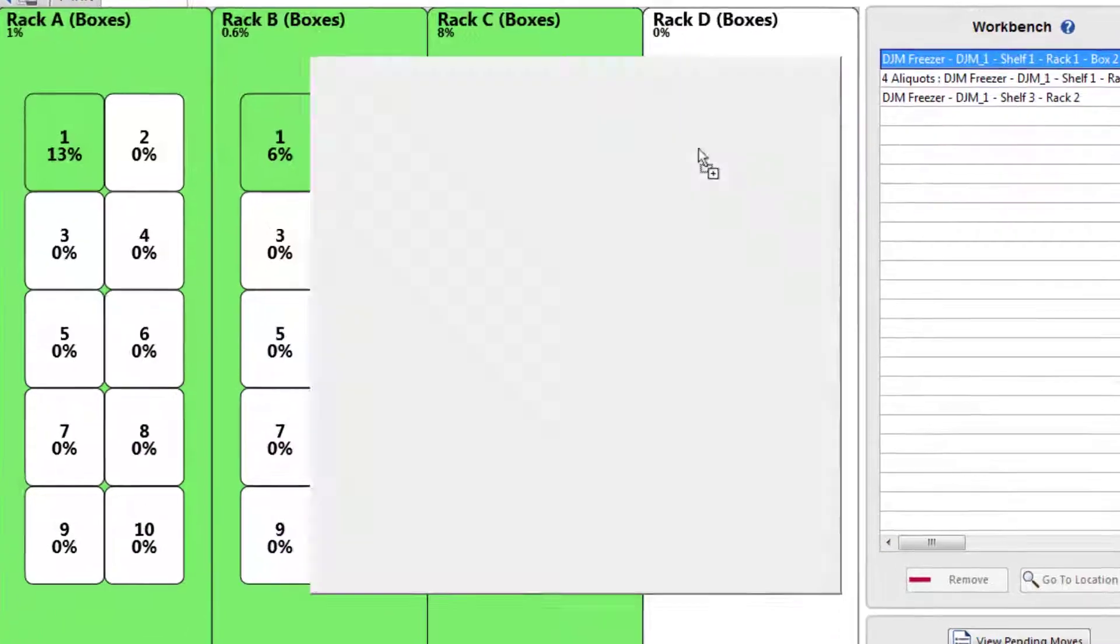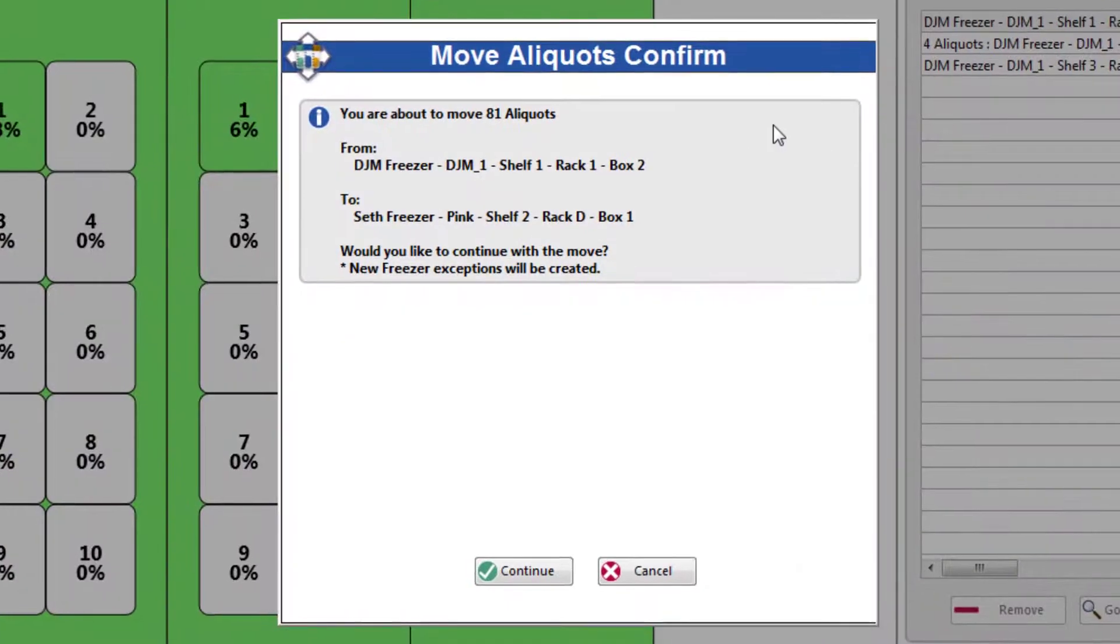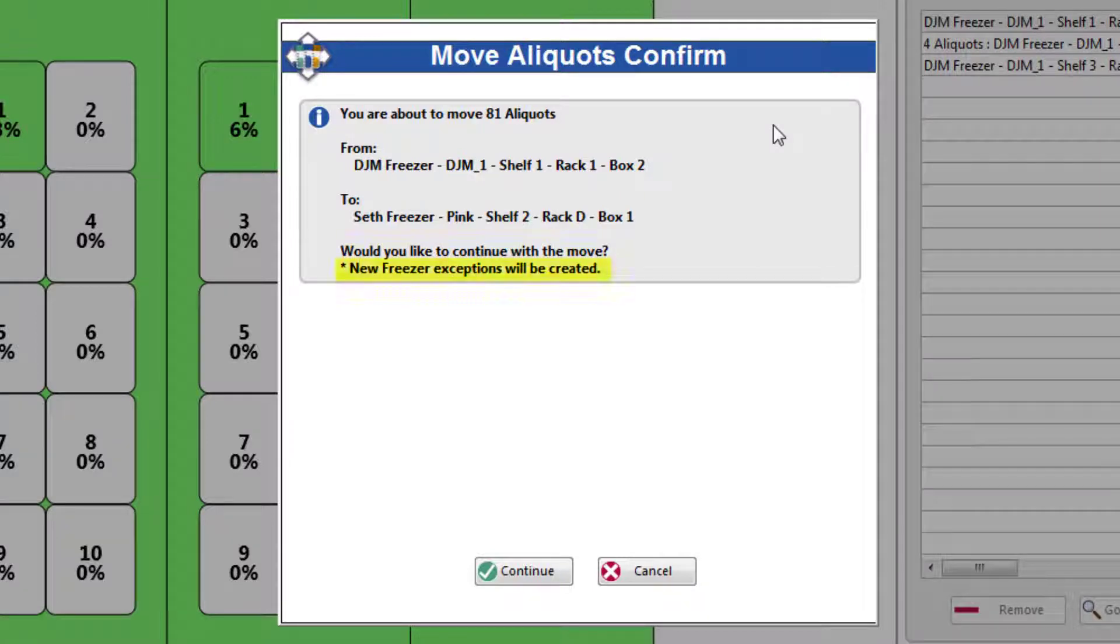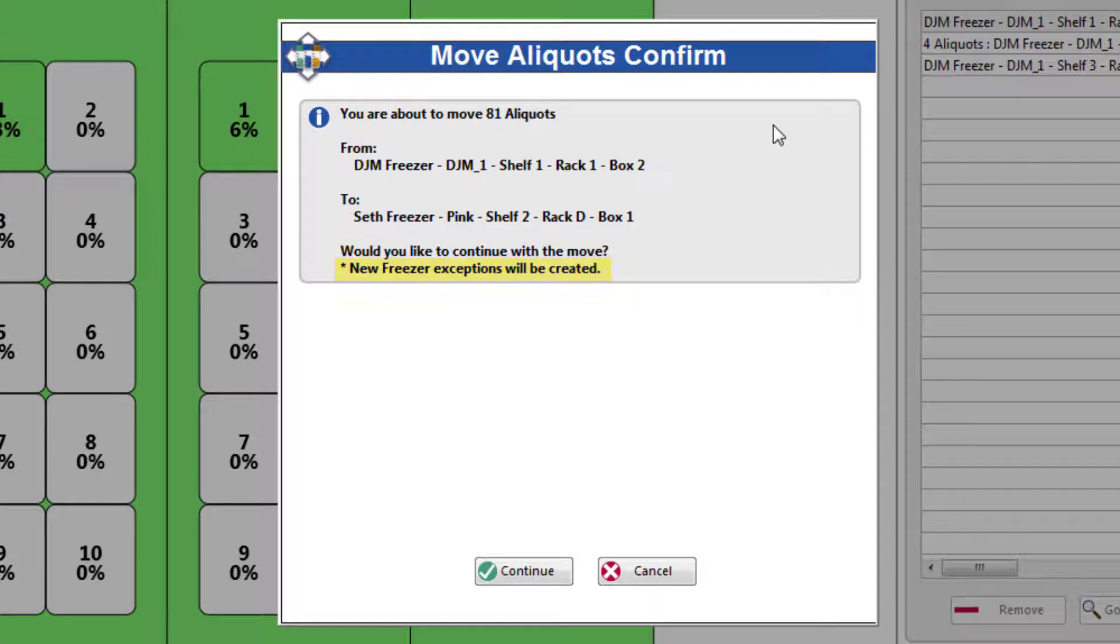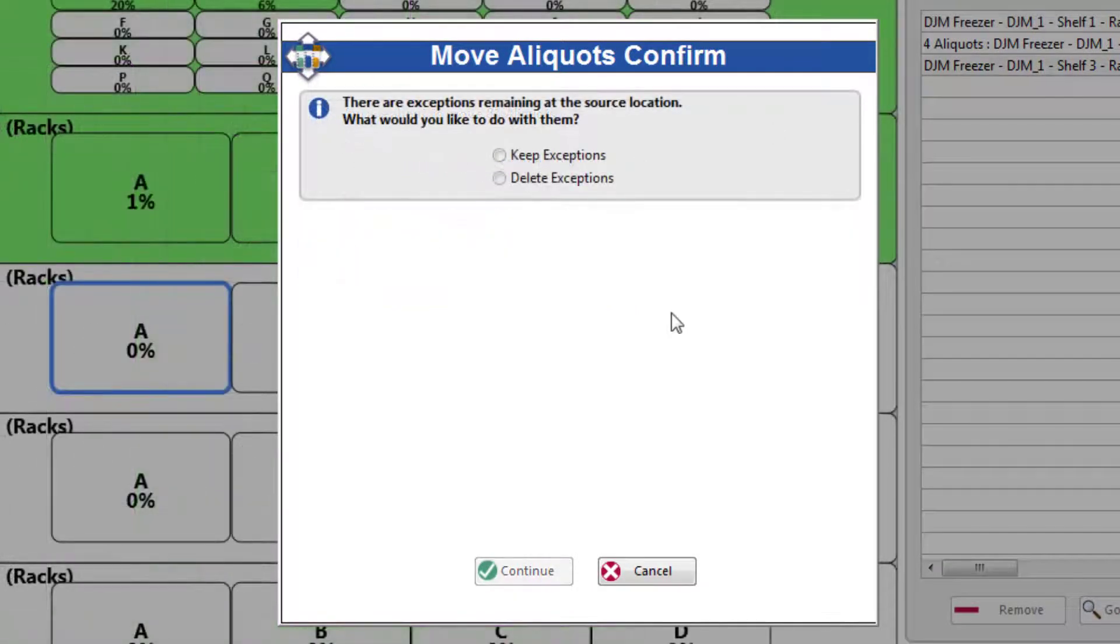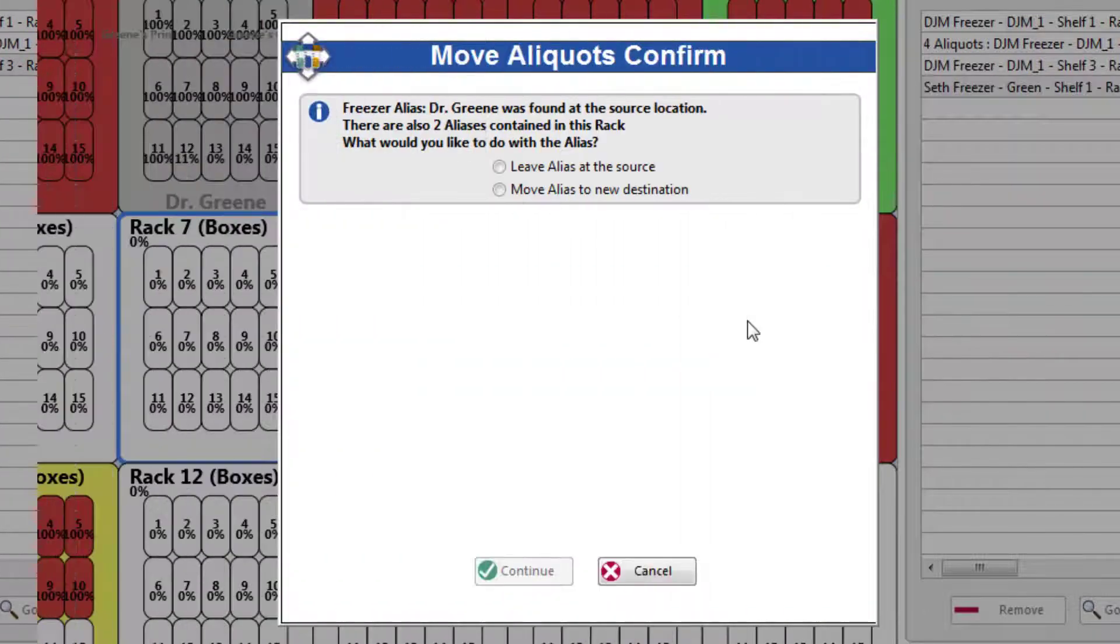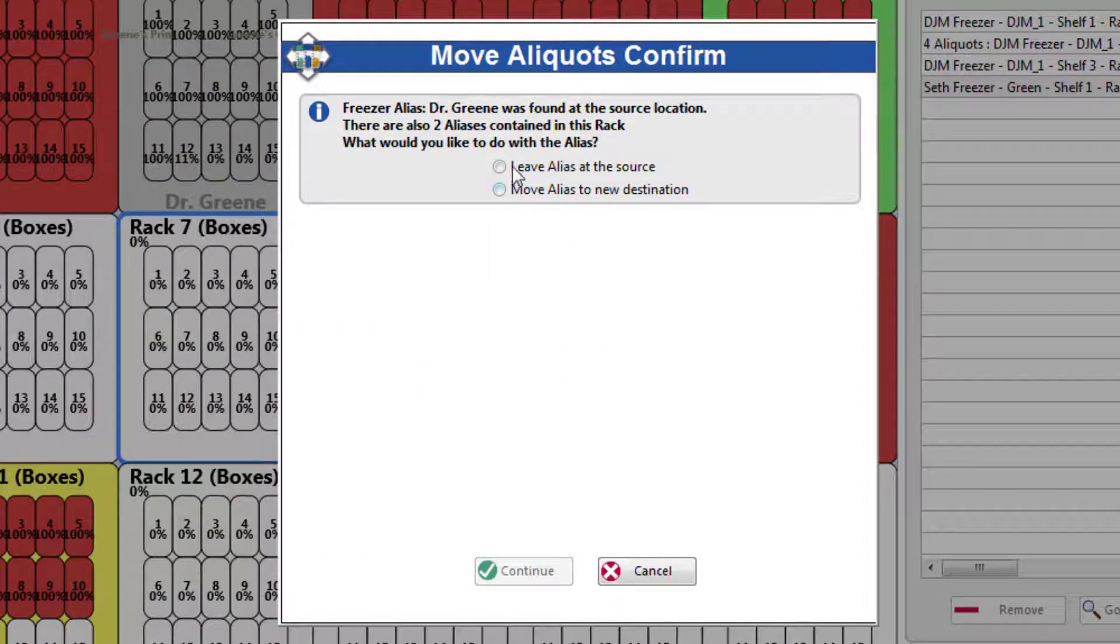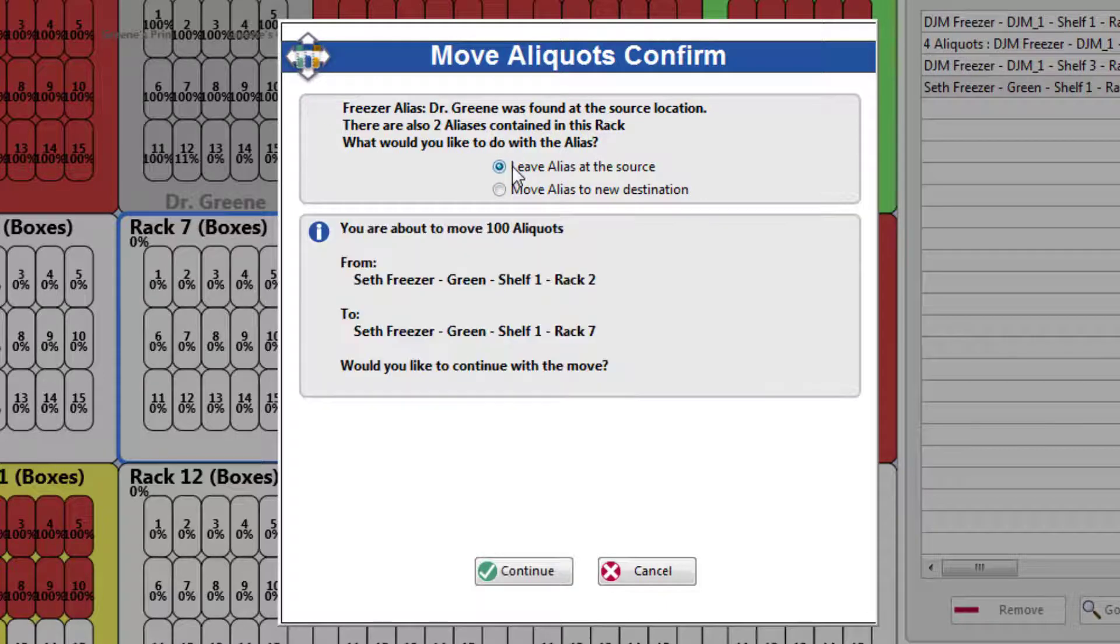A confirmation will appear with each move, telling you how many aliquots are being moved and if exceptions need to be created or handled. In the past, freezer configurations needed to be identical for moves to be allowed. Now, Freezerworks will automatically create exceptions for destinations when necessary and ask you what to do with exceptions at sources. Also, if you are moving any aliases, Freezerworks will ask whether to move the alias to the destination as well or keep it at the source.